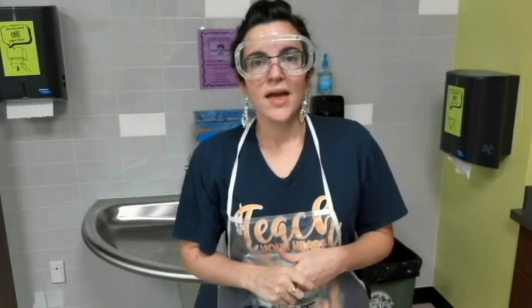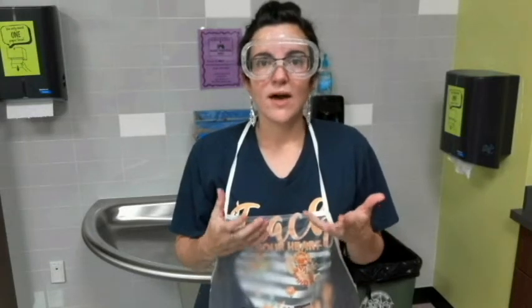Hey everyone, it's Miss Bell here again in the science lab, and I'm wanting to talk to you about disposing of items in the science lab. Now, what I mean by disposing is getting rid of or throwing away items. Sometimes we have items that we can put straight into the trash can. Other items we have that are safe to pour down the sink.